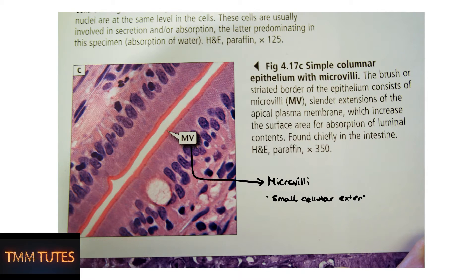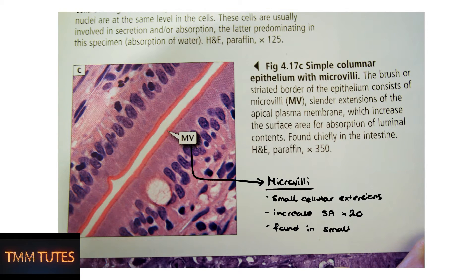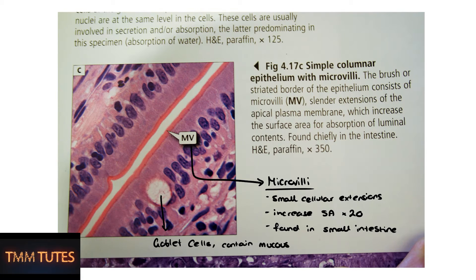For example, here we have microvilli — little branches that extend from the cellular surface, increasing the surface area by about 20-fold. These are mostly found in the small intestine and really aid in absorption.